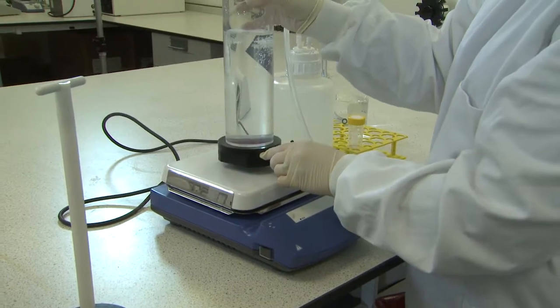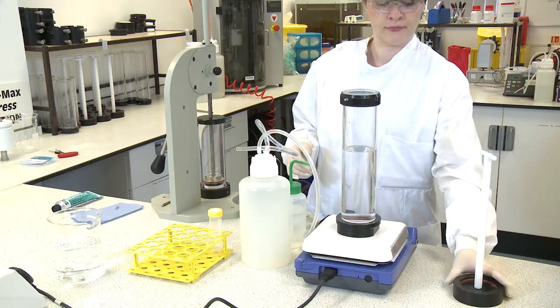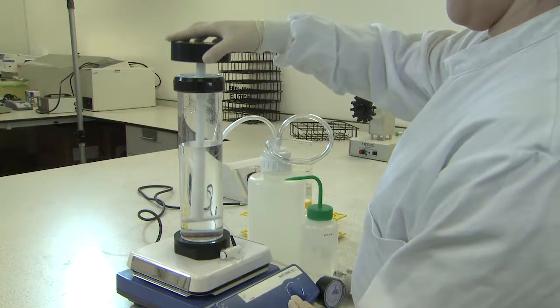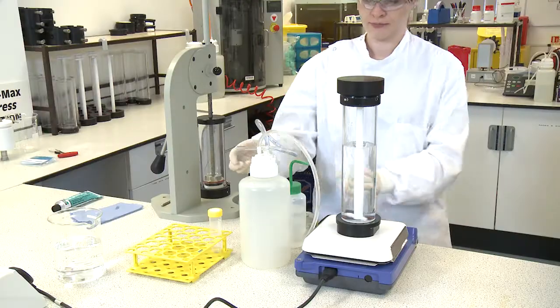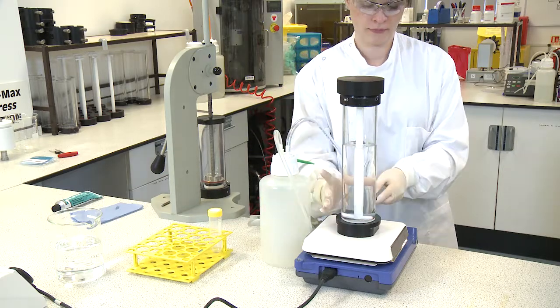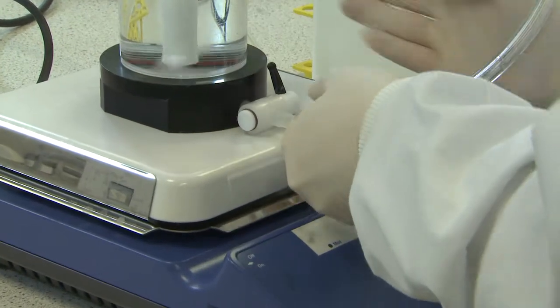Place the assembled concentrator tube on a magnetic stirrer plate and attach the magnetic stirrer bar. Begin gentle stirring. Connect the waste bottle and hand pump to the tap on the concentrator base.